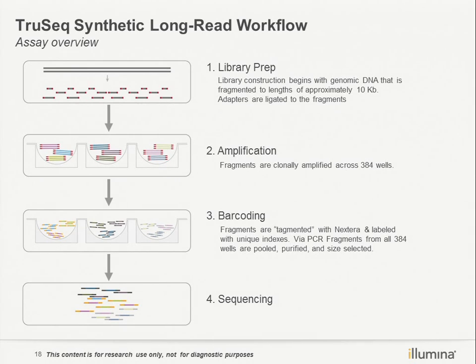After sequencing, we firstly identify where each sequence comes from. For example, this sequence has the index with, for example, the yellow light, so we can see that it comes from this well. We first construct all the small sequences from this well and get this 10 kilobase long sequence from this well.